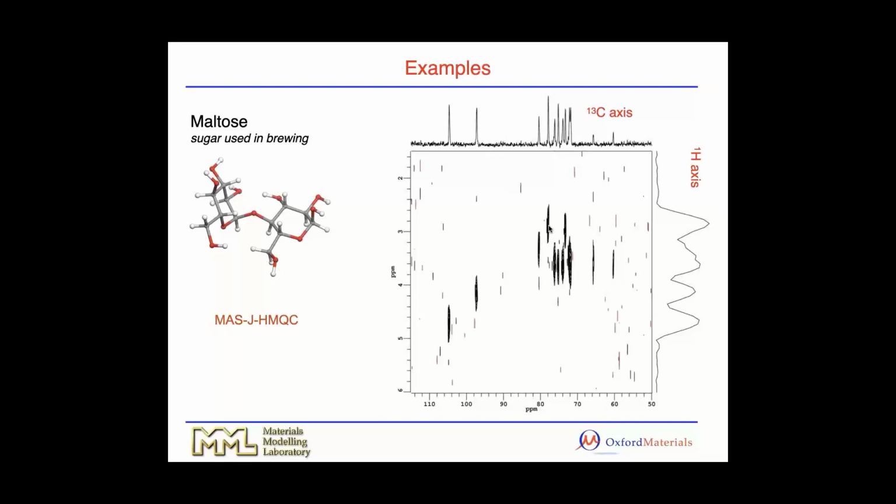So let me first of all do a CASTEP calculation in which I treat the system as an isolated molecule. Okay, I get the blue crosses, and they're not disastrous. They're on the right graph. They seem a bit shifted, but if I move this one down here, I'd have to move this second one a huge way down to match over. So I can't trivially just move that around. So that's not disastrous, but not great.